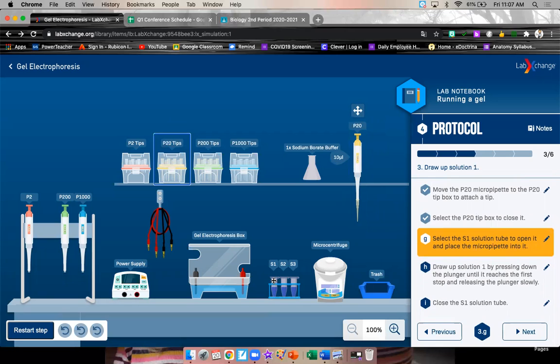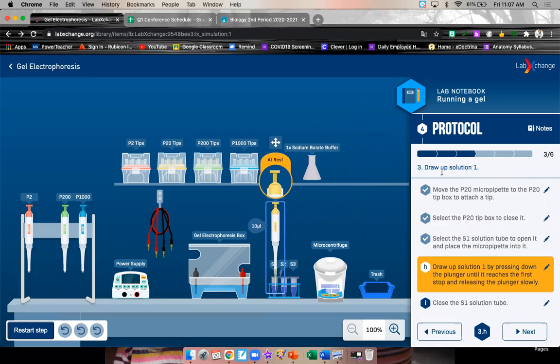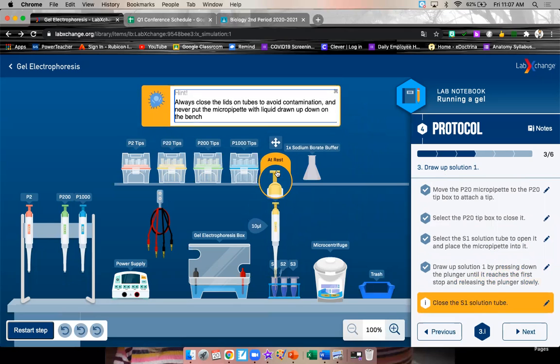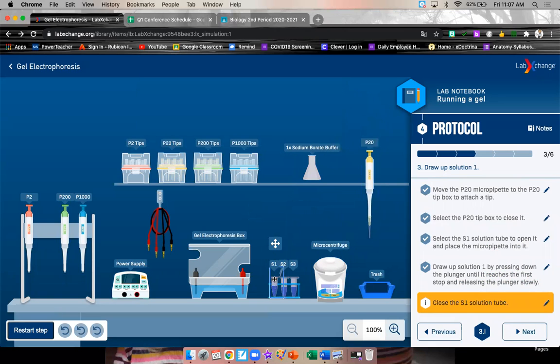Select the S1 solution to open it. And place the pipette in there. Now this is where you want to be careful. You're going to click this to reach the first stop and then let go. You reach the second stop, you grab too much. First stop and then let go. All right. Now close the lid.